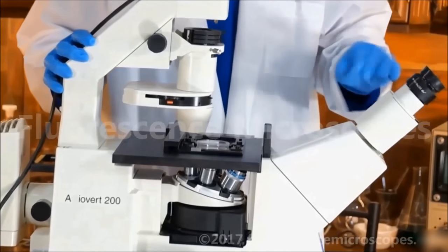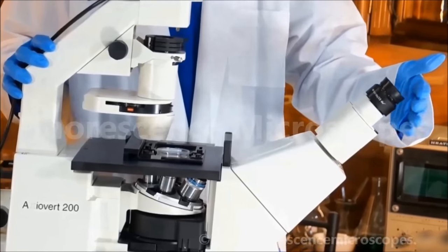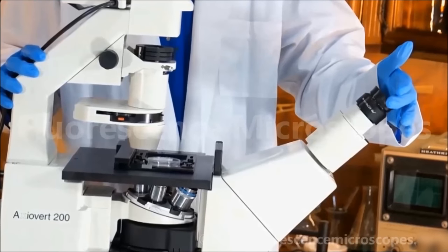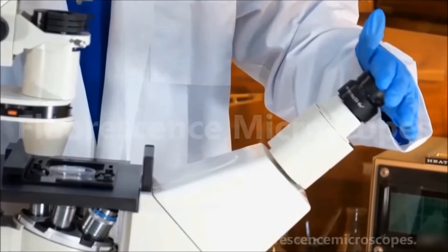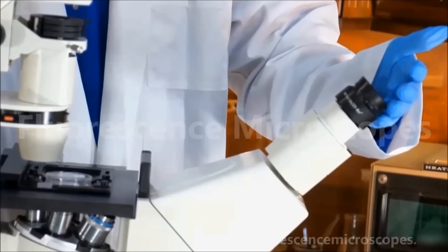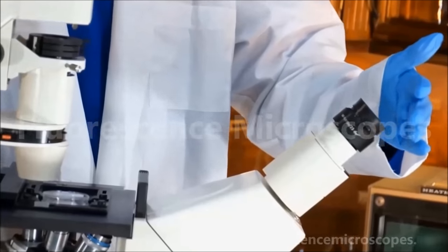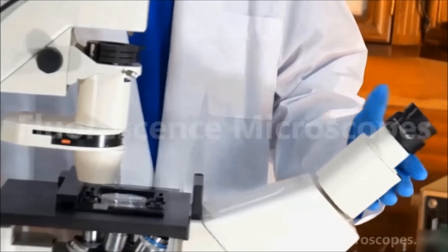We've got a binocular head and we've got the rubber eye cup eye guards. Those are useful for blocking the extraneous light in the room so that you can visualize the low lux fluorescence signal.